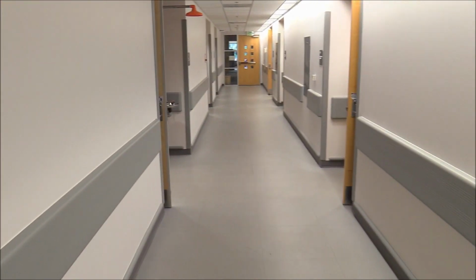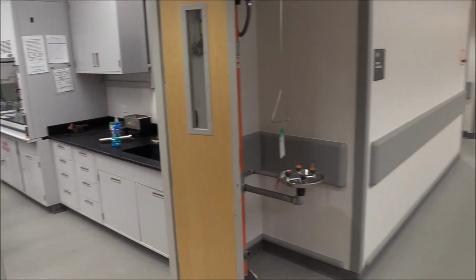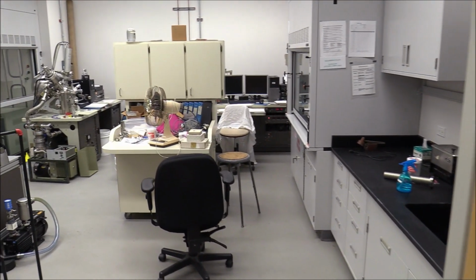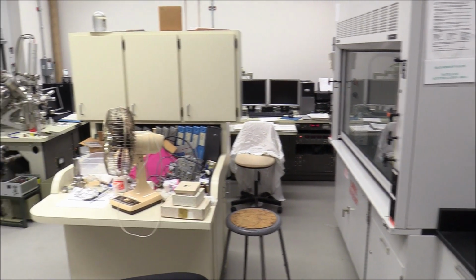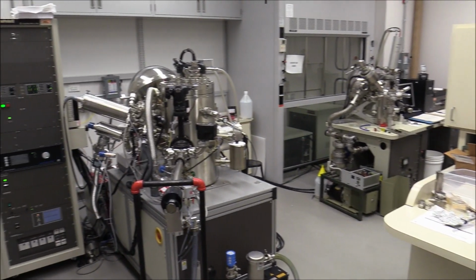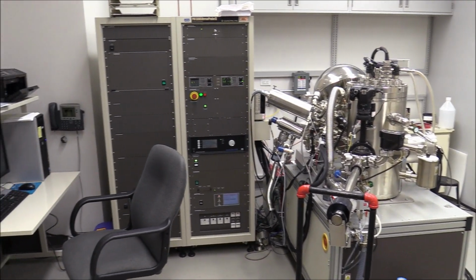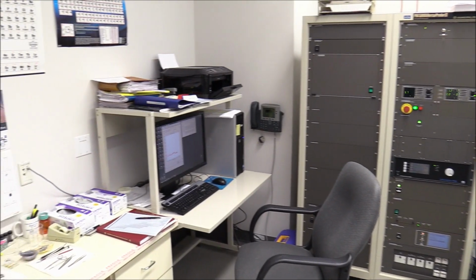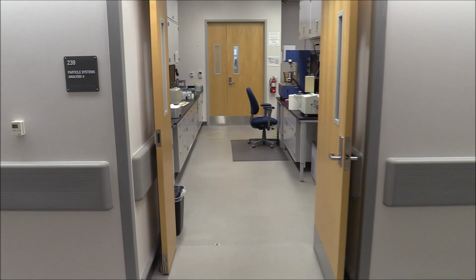The next lab that we're going to is called the Surface Analysis Lab, and it houses instruments for the analysis of the top atomic layers in the surface of a sample. The lab consists of two X-ray photoelectron spectroscopy systems, or XPS, and an Auger electron spectroscopy system, or AES. Coming out of this room, we're going to move on to the final room of this tour.